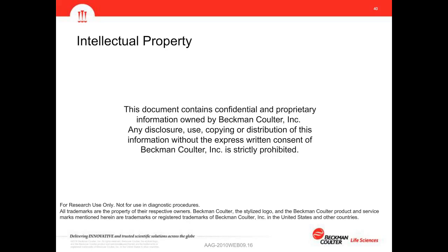Yeah, that's maybe me taking a little bit of liberty here, being figurative. But when the Biomek pipettor puts tips down into a microplate and we aspirate sample, the software behind the scenes is going to look at the well data that is present on that plate.